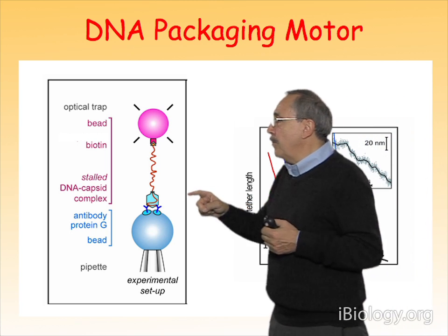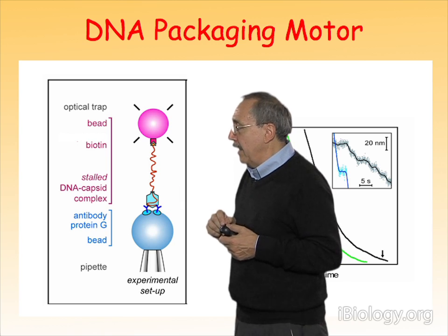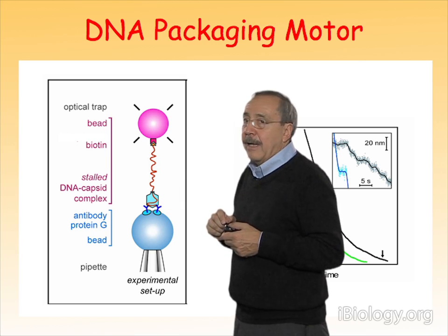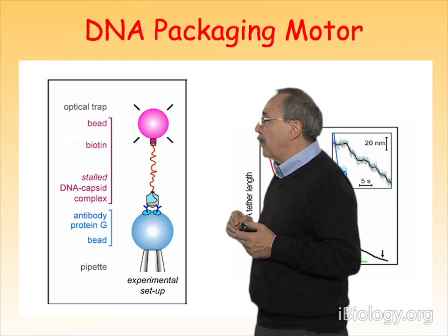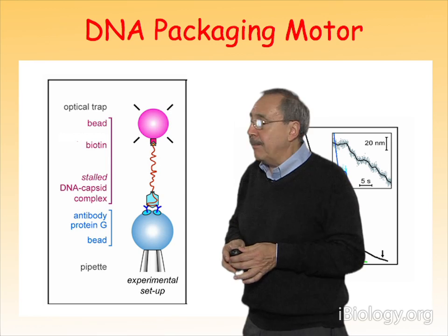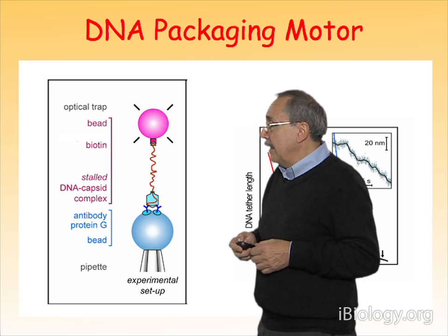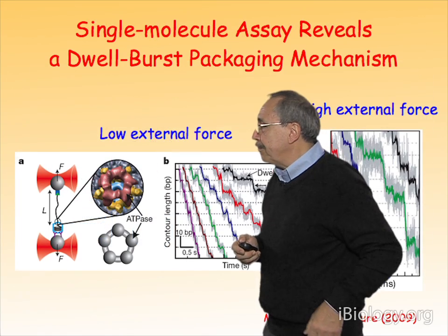We are very interested in this motor because it's a very nice example of a ring ATPase. And as you know, cells are full of ring ATPases that carry all kinds of mechanical and transport functions. And so we are studying this motor as a system to try to understand how the motor, in this case, translocates the DNA.